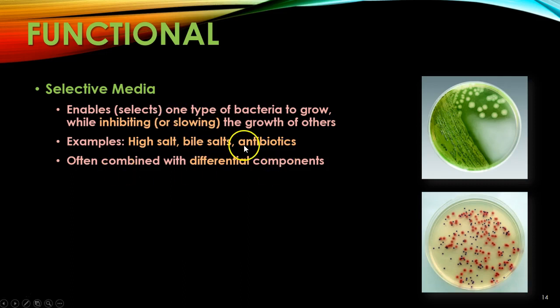We have bacteria growing in our intestinal tract, and they're used to seeing bile salts. It doesn't bother them. But something like our staph might be inhibited by it. In other cases, we might be using antibiotics. When they came across Legionella way back in the 80s or 70s, it was mixed in with a lot of other bacteria, and they ended up having to use antibiotics that it was naturally resistant to, to help isolate it.